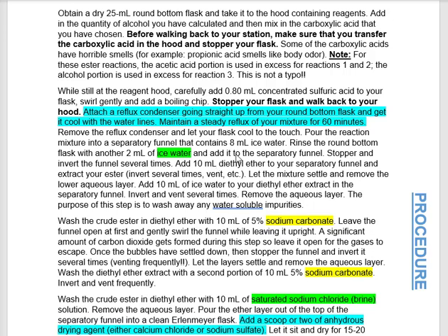Then, after you've done that in the separatory funnel, you're going to take the organic phase and react it with sodium carbonate, or throw in a sodium carbonate solution, and you're going to do that 2 times in the separatory funnel. Then it says you're going to have saturated sodium chloride, a brine solution, which is in water. This is an aqueous solution. So you have an aqueous wash step, an aqueous wash step, an aqueous wash step. So my question comes to you: what is the point of sodium carbonate?